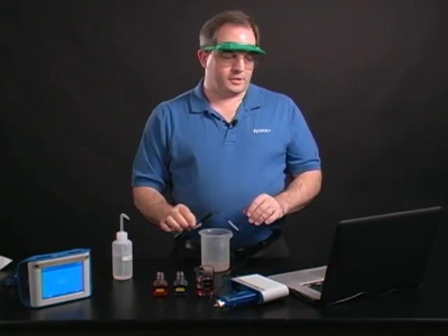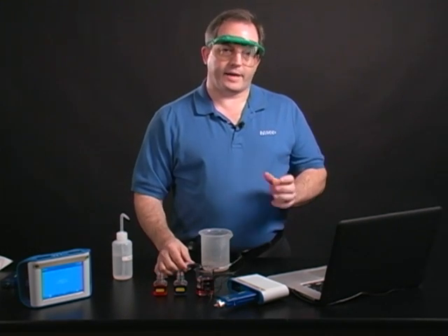Now I'm ready to set up for calibration. The first thing I want to do is create a SparkLab because that's where the calibration will be saved.